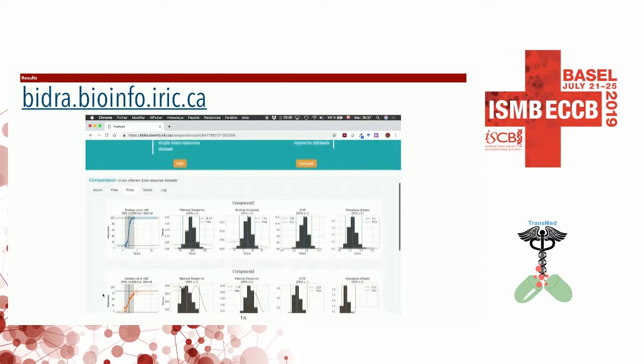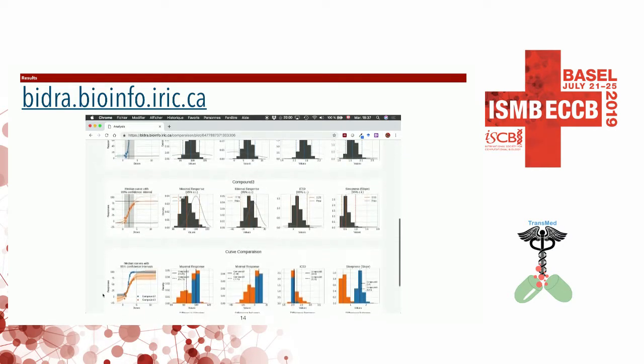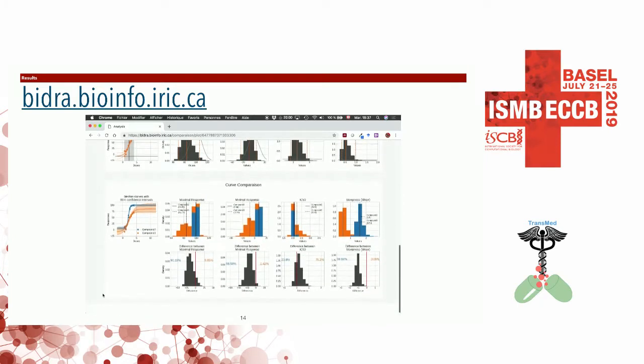So we get, as you can see, the graph generated here looks a lot like the graph that I've presented so far. So all the graphs that are in this presentation and in the paper were obtained on our web interface. So we've now created a tool for biologists and medicinal chemists to analyze and compare dose-response experiments while characterizing data noise and the uncertainty of the efficacy metrics, and by also implementing their intuition into the computation.